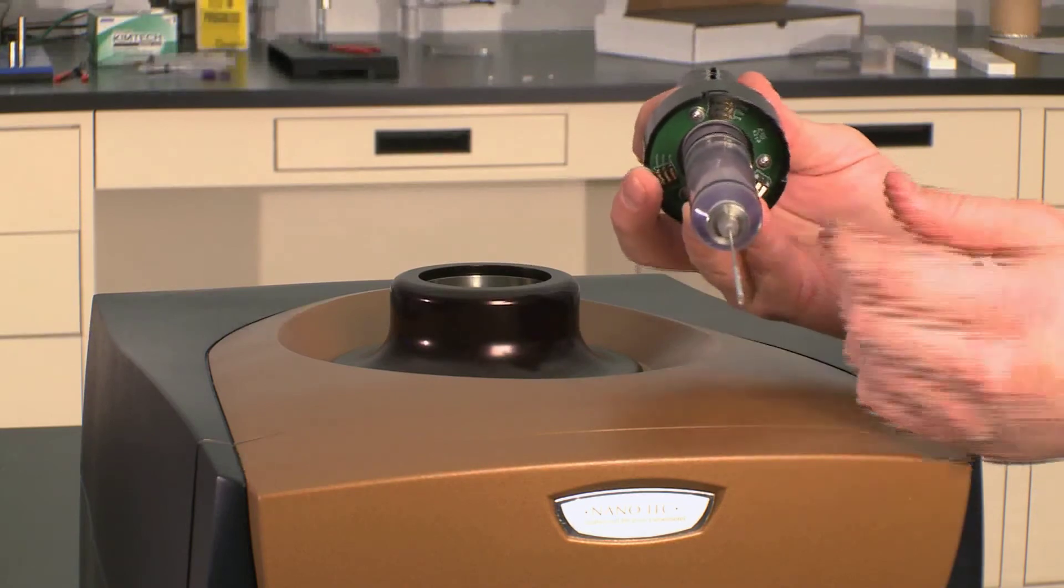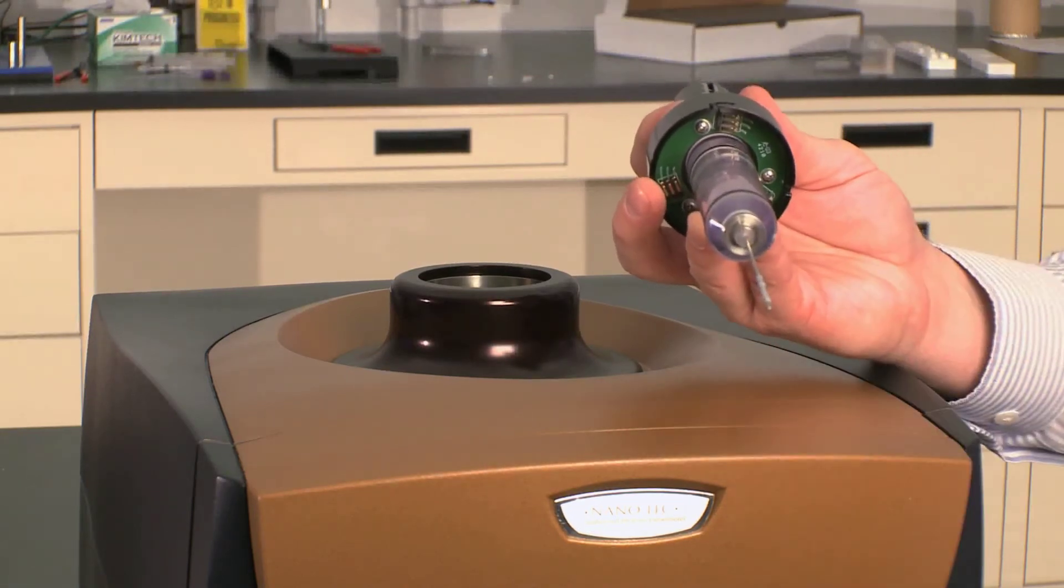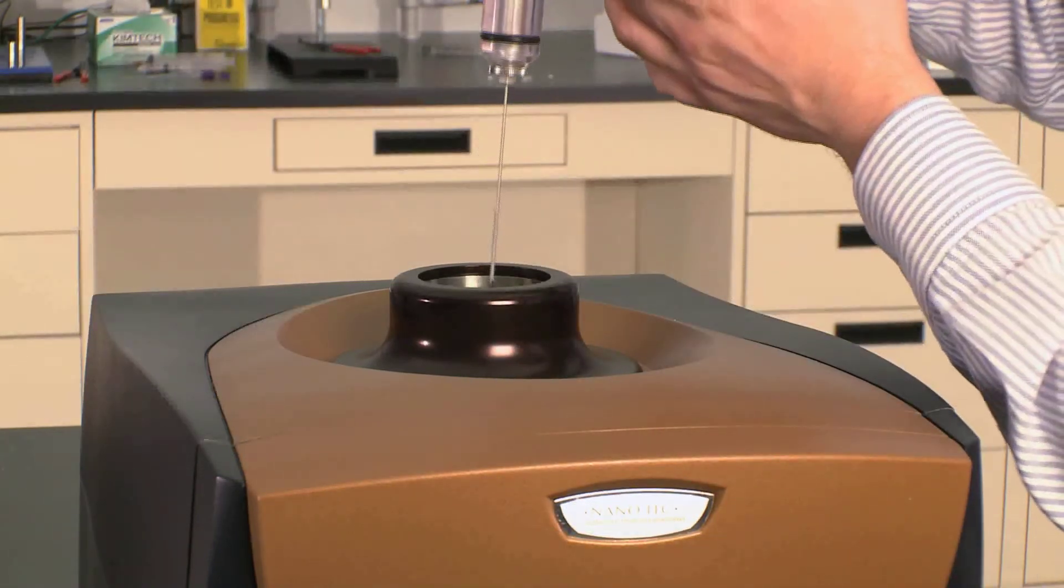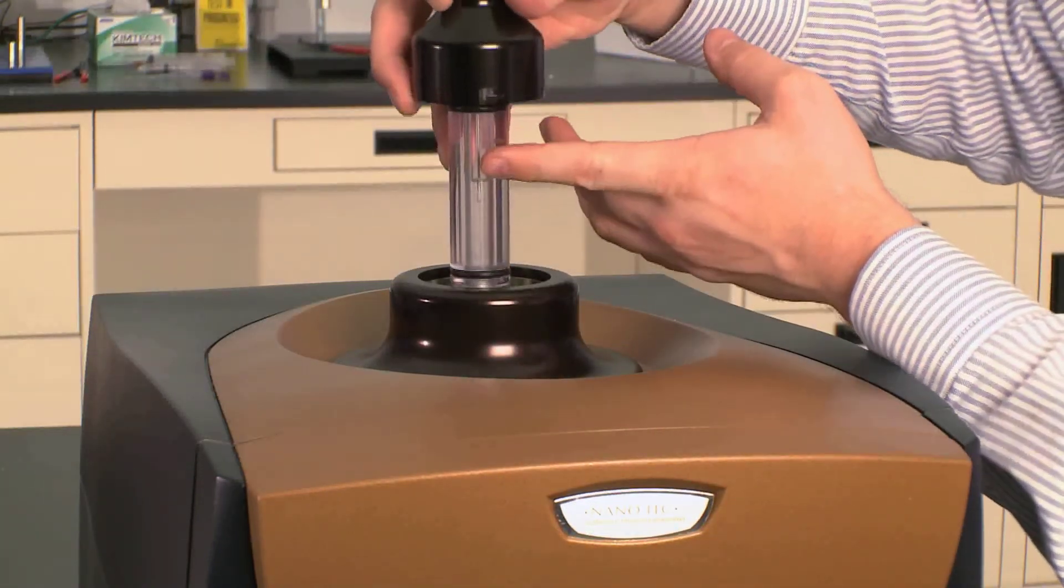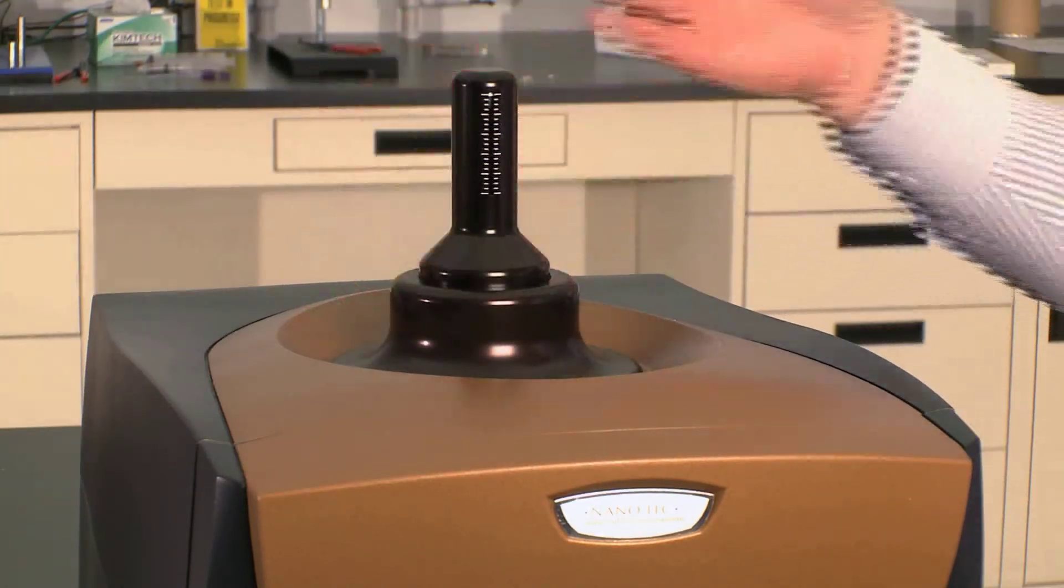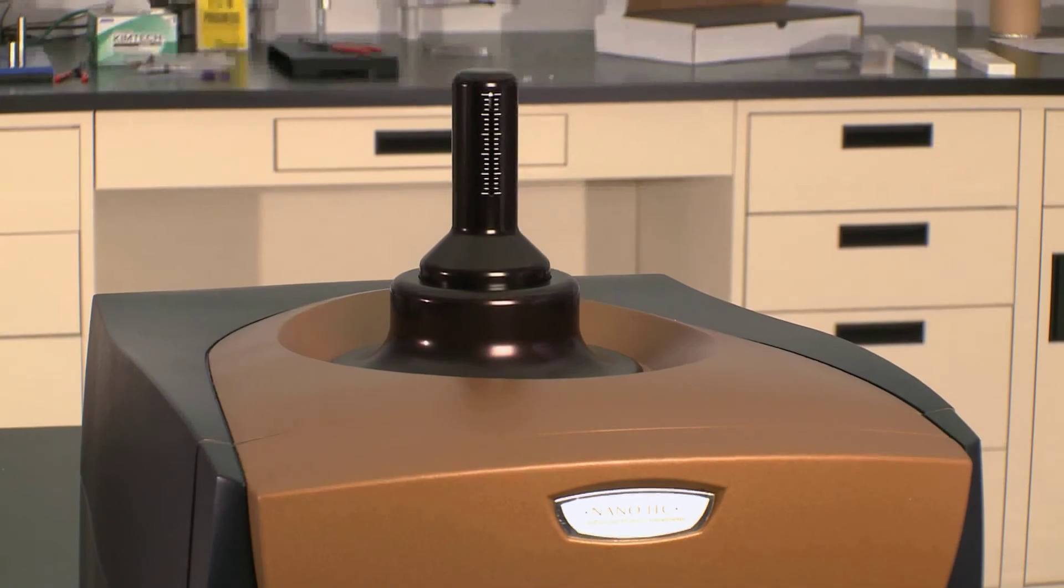And if you had it over full you're going to see a little droplet of water at the tip of the syringe. And you want to dab that dry. And now you can place this right back into the instrument. Slowly lower it down and lock it in place. Now you're ready for the experiment.